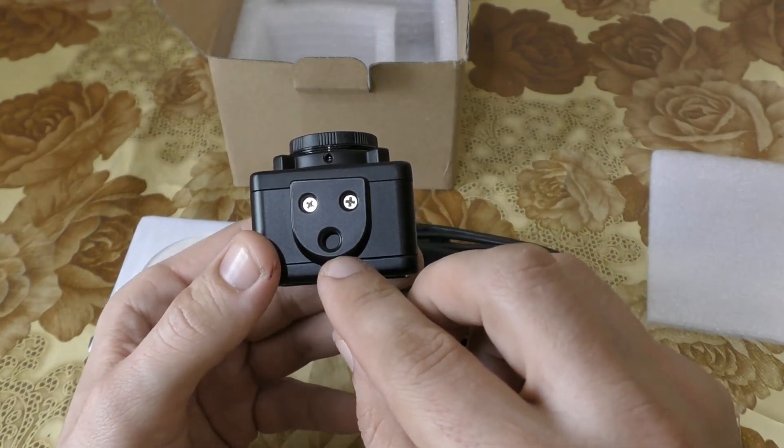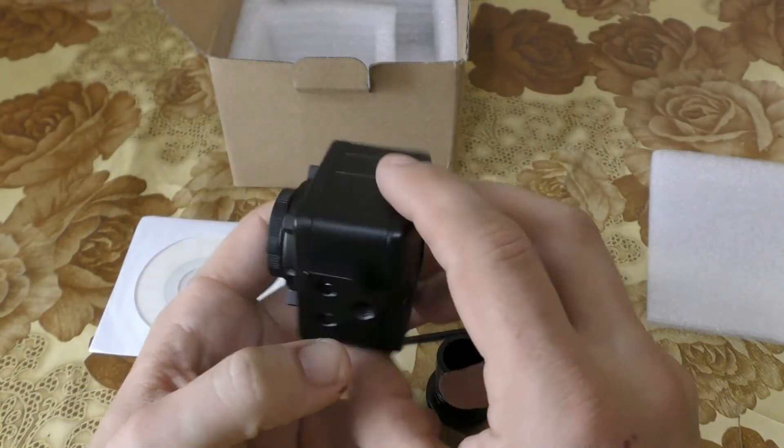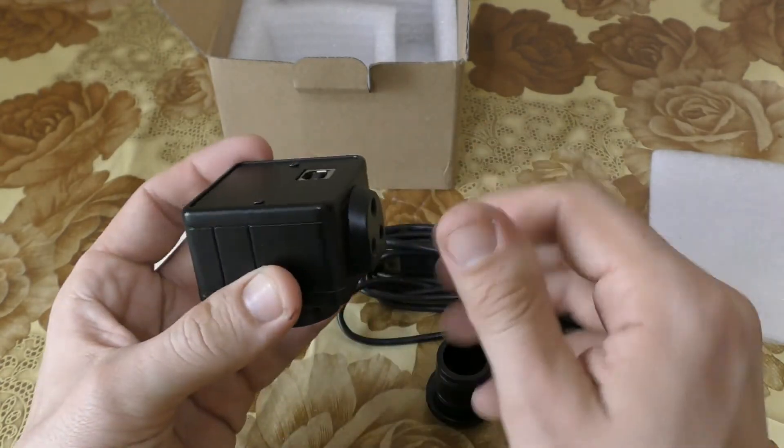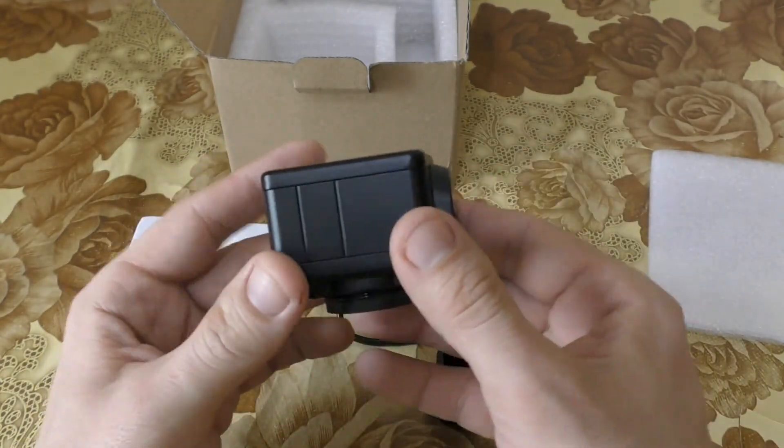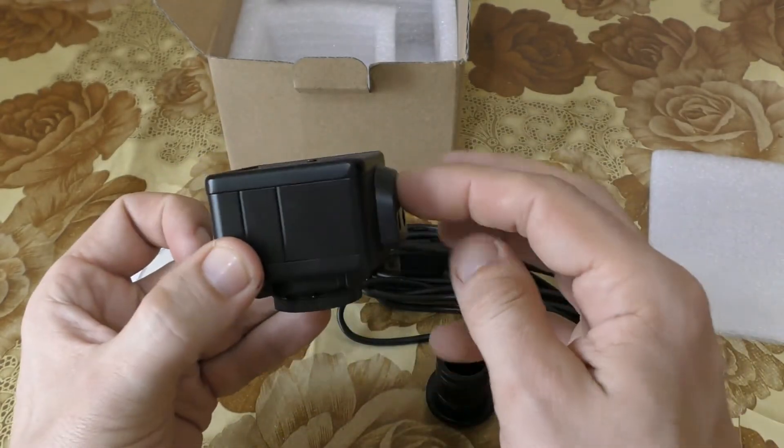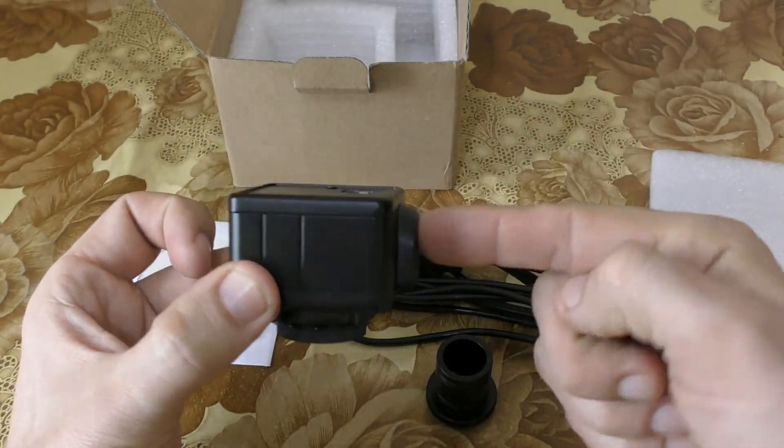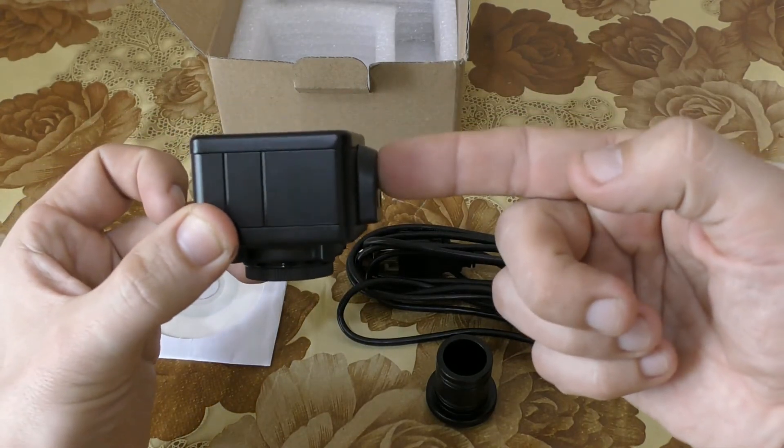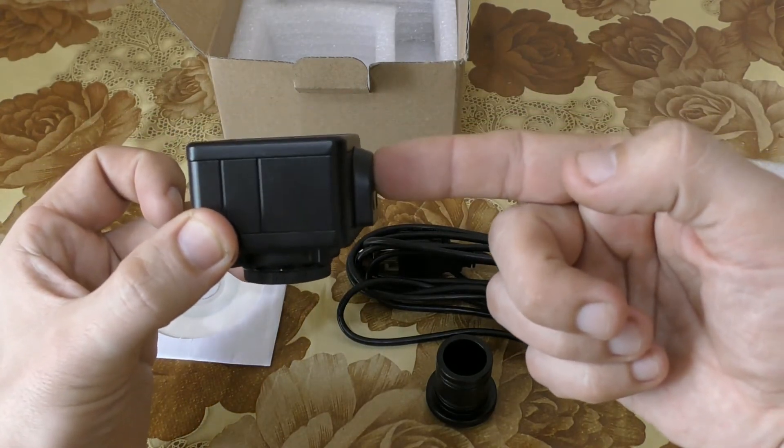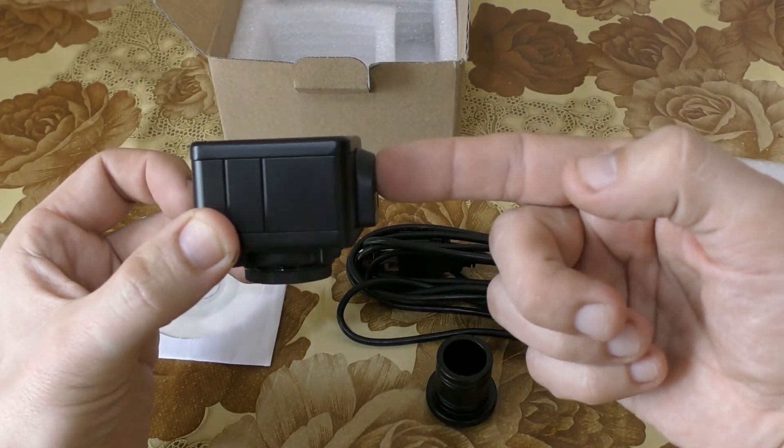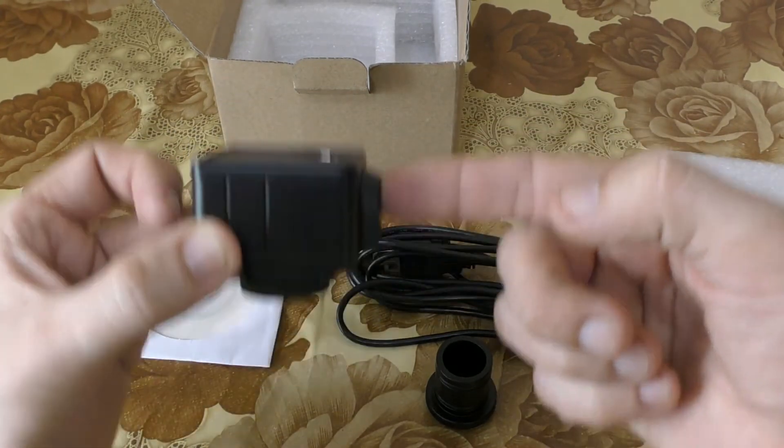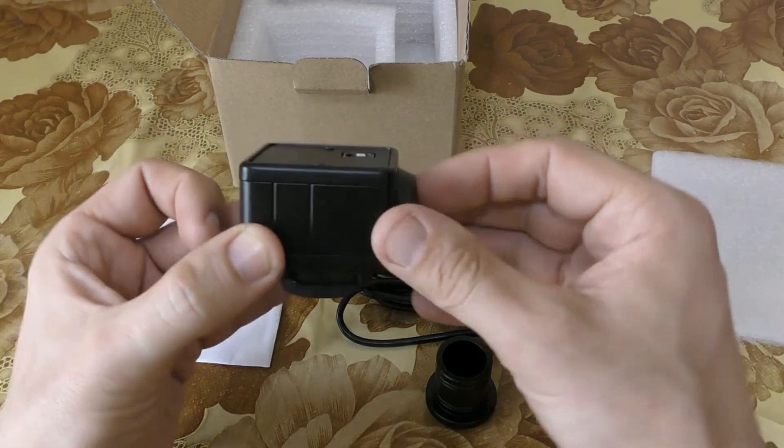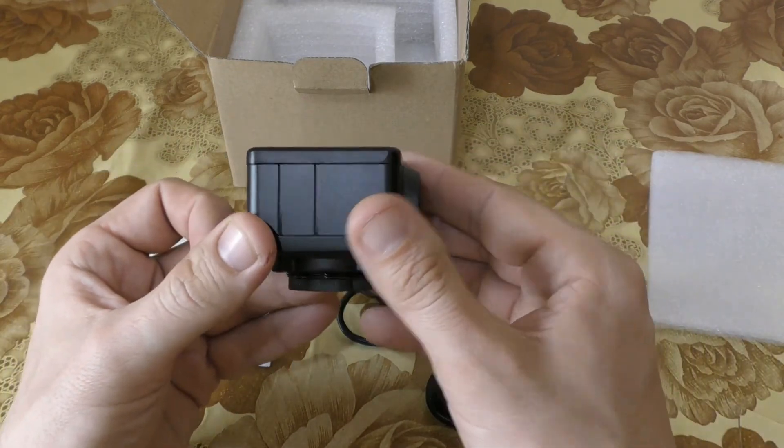You have a hole for the screw, so you can fix it like this and mount it on some measuring stuff.